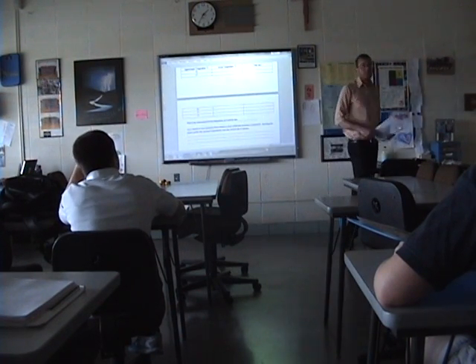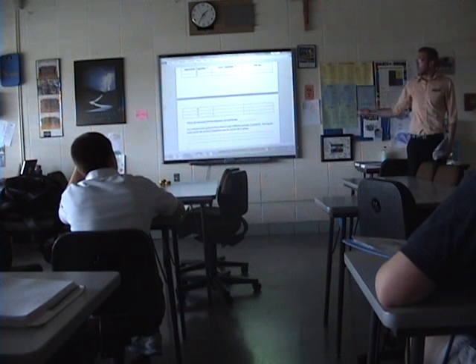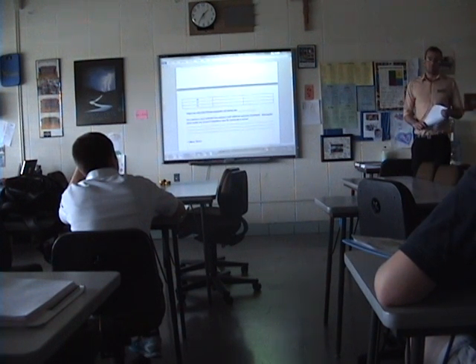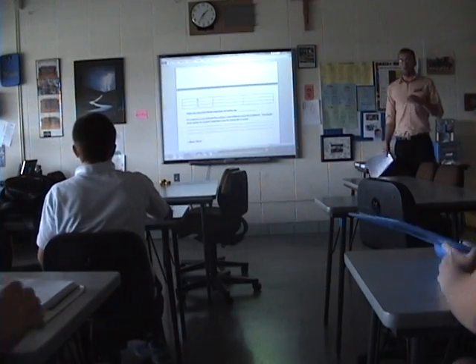So what you're going to do is put the beakers in there, get them up to around 40 or 55, whatever the actual temperature is, and then you're going to mix them together. Do you guys have any questions about this? All right, we'll do some more lab. All right, let's do it.